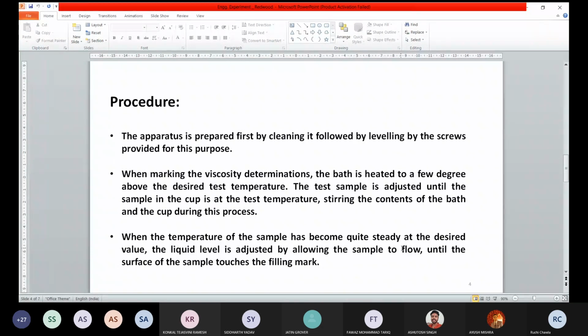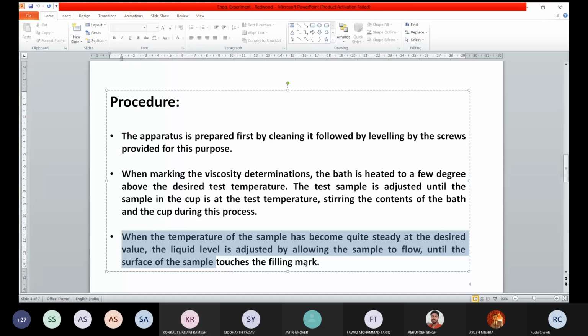don't you fill the burettes in the same manner? Means you fill excess of it and then you allow it to flow from the opening so that it is adjusted to the zero level mark. So have you followed this point? How will you adjust the mark in the oil cup?